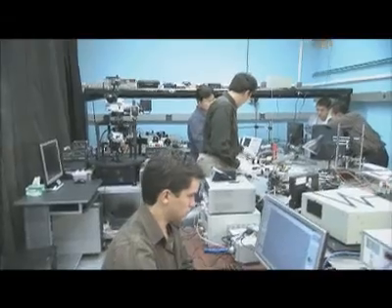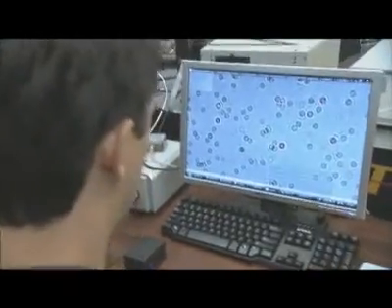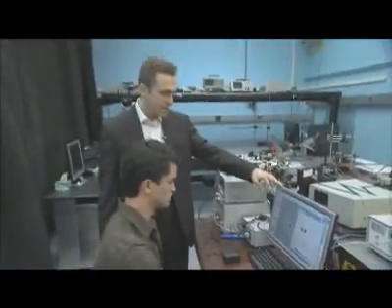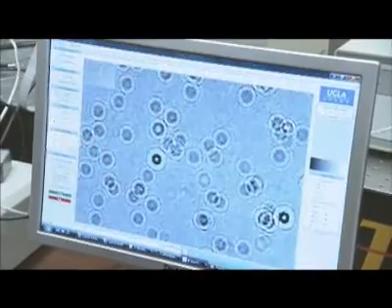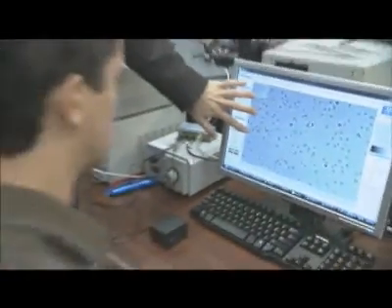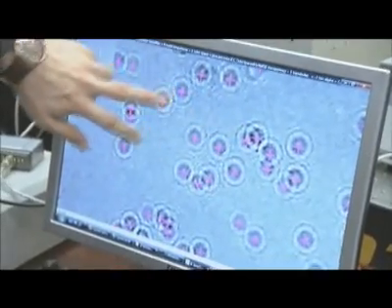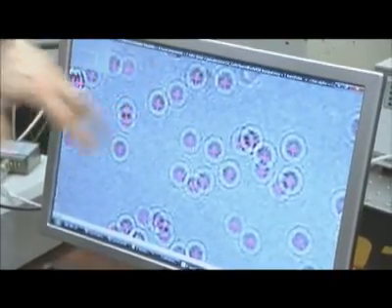"So this is our lab space where we test our ideas. We can detect holograms of each cell or bacteria digitally. So for each cell type that we want to analyze, we have library images of the same hologram, of the same cell type. What we do is we load the library images of that hologram, and then the algorithm does a pattern matching. So we can identify all the red blood cells based on a match to what we have in our library images. So if there was a disease like malaria, for instance, you would see the hologram of the red blood cells show deficiencies. So that disease would actually show a contrast difference."